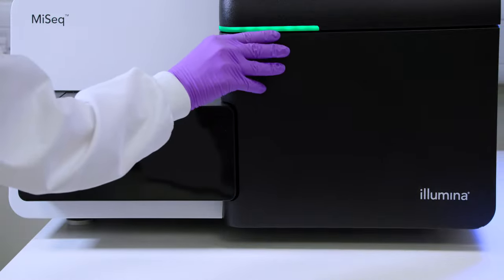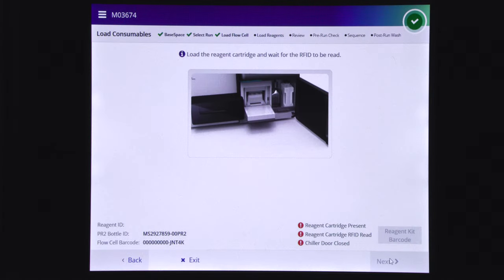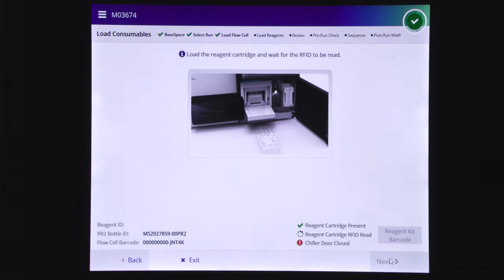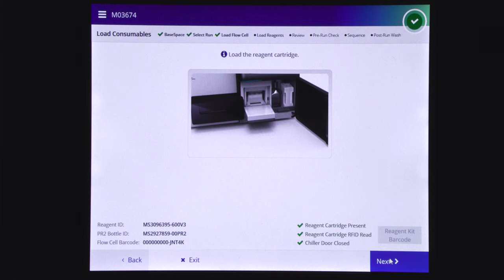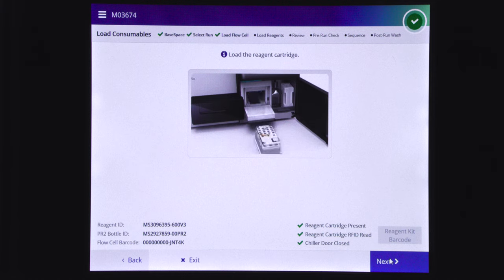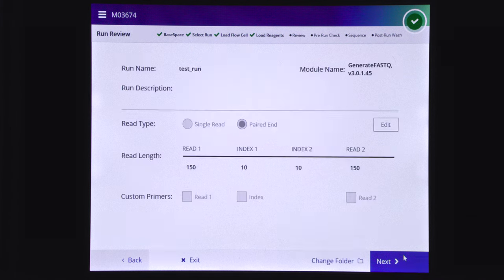The control software will identify the RFID of the reagent cartridge. If the software does not identify the RFID of the reagent cartridge, check the Resolve RFID Read Failure section in the MySeq system guide. After RFID identification is completed, select next.